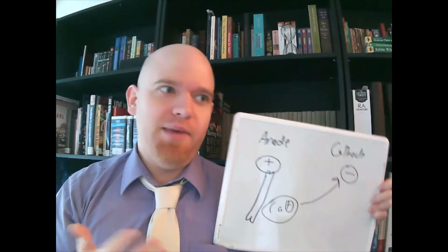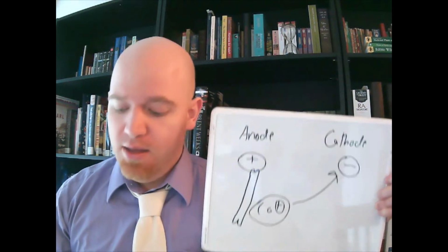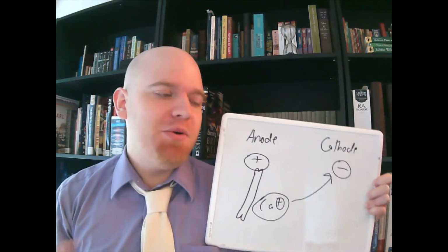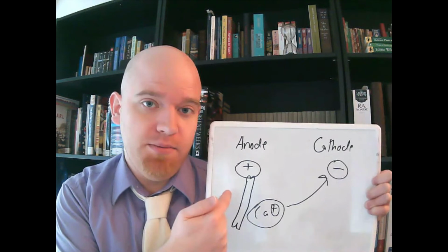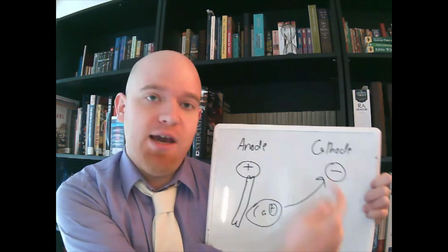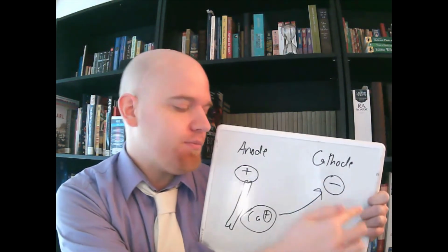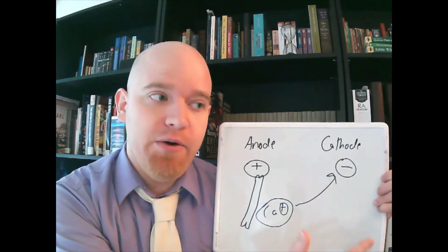Our third acid-mediated method for decalcification is just electrolytic. What we're going to do here is actually attach our bone to an anode, which is a positive pole, and we're going to have a cathode in the outer part of the solution. We're going to run electricity through that, and what that does is it causes electrons to flow.